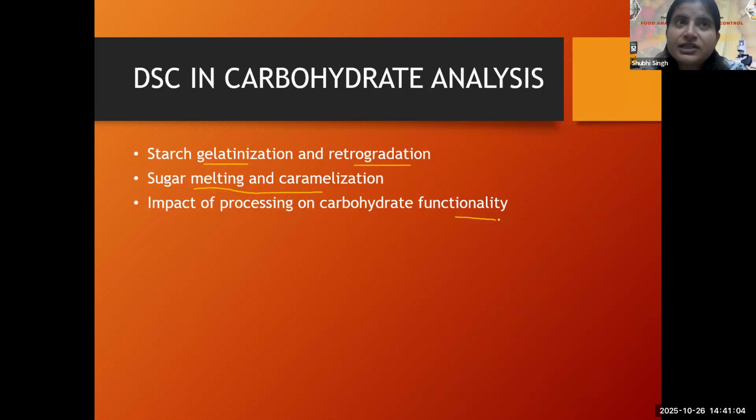So it is subject to the type of cooking or processing method you give to your starch sample. Based on these factors, your thermogram will be affected.